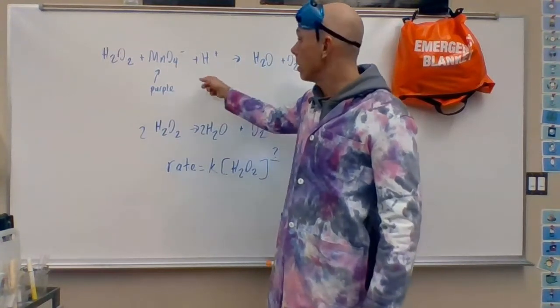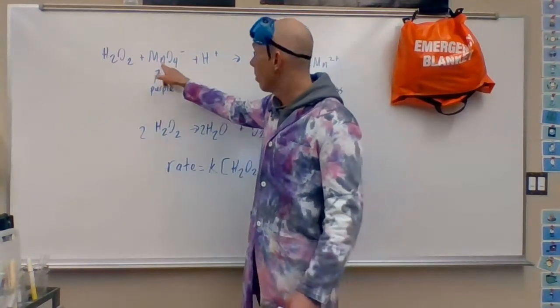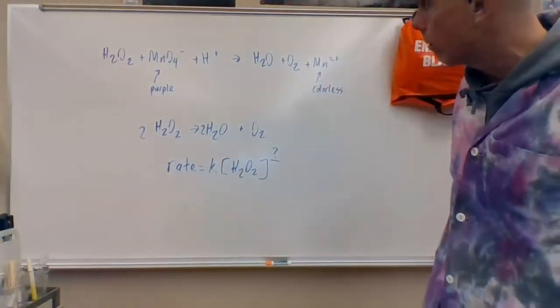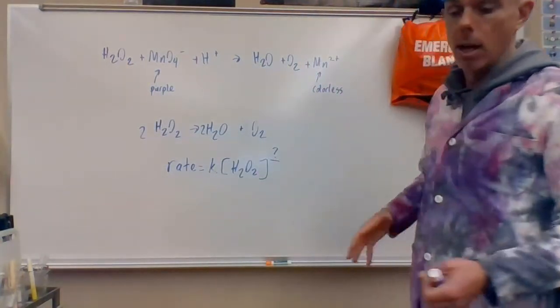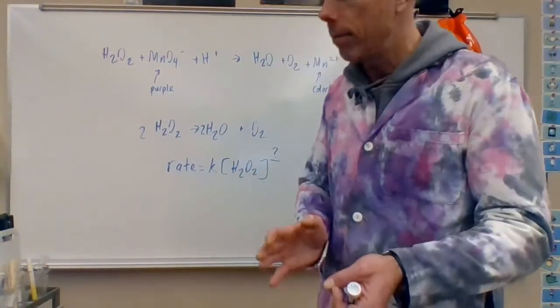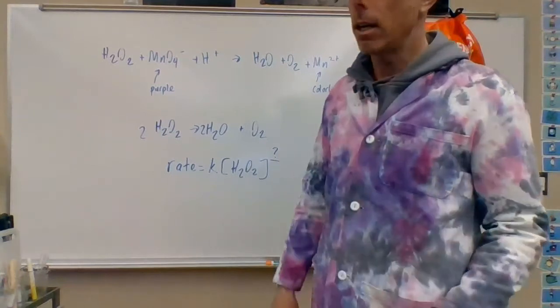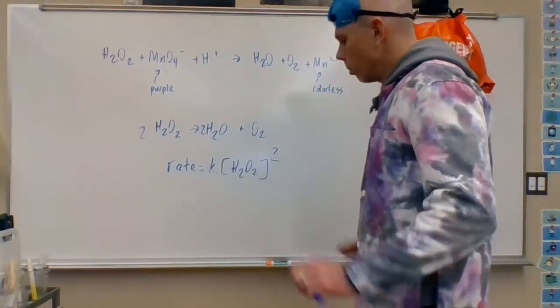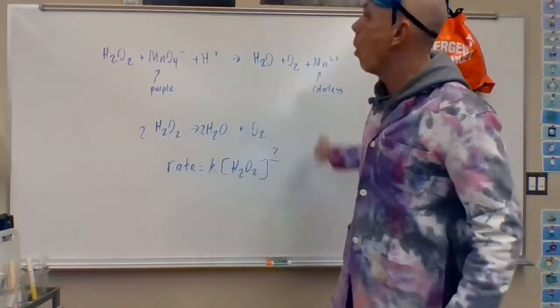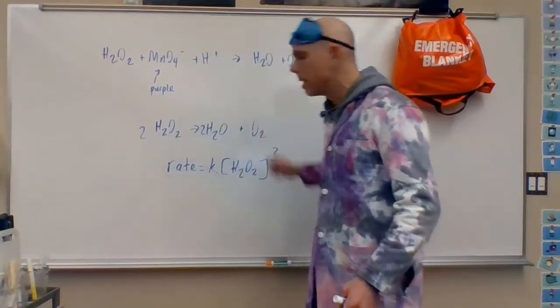At that equivalence point, we know that moles of permanganate equal moles of peroxide, at least stoichiometrically. You've got to balance it and account for the coefficients, which allows us to then know how many moles of hydrogen peroxide were in the analyte flask, and that's going to allow us to calculate the concentration. It's a pretty tricky technique, which I'll do here in a moment, but what we're going to be doing is adding permanganate over time to hydrogen peroxide as it's decomposing.